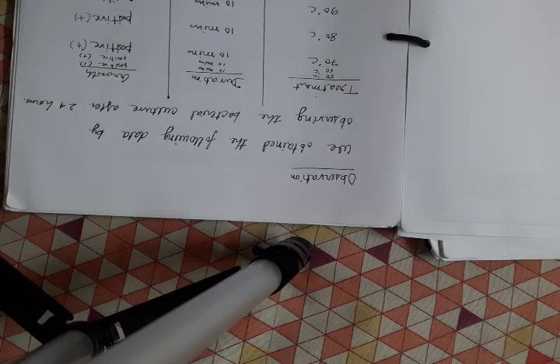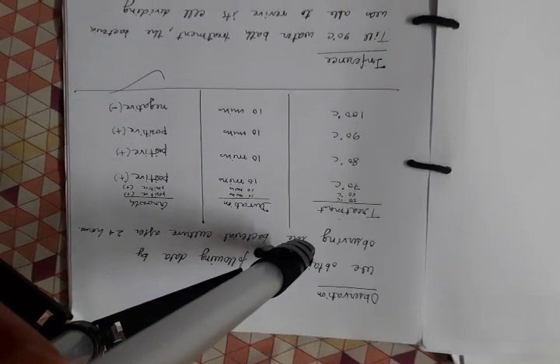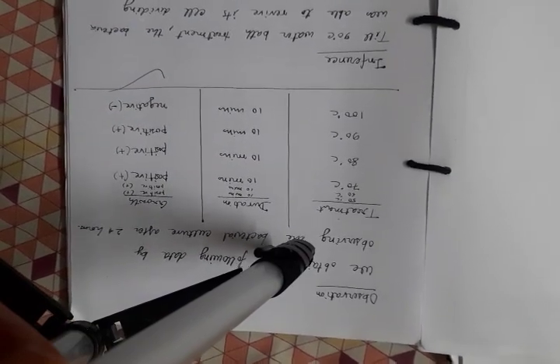And what more? That's it. And one thing I guess I haven't written out here is the control. I guess I should have written it out here.